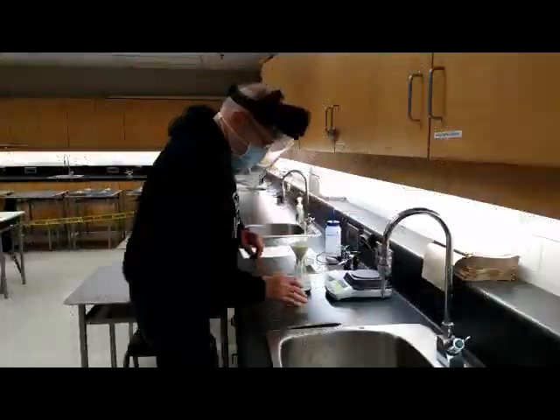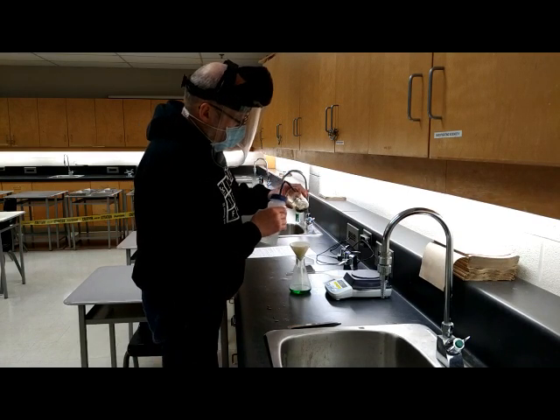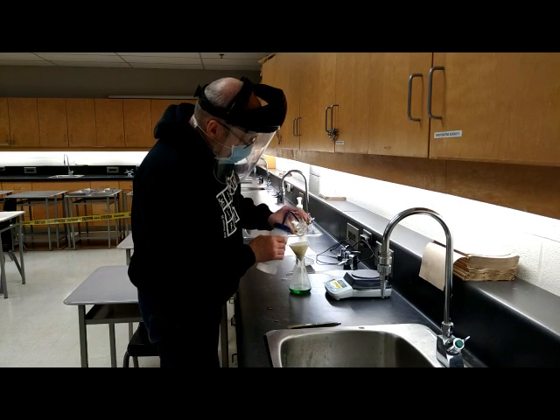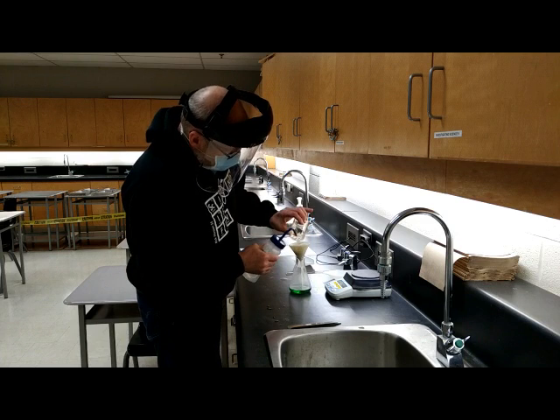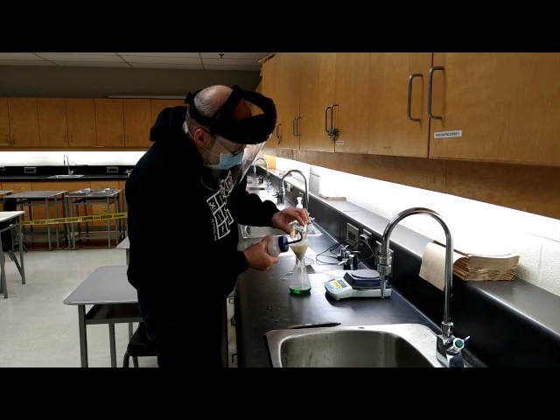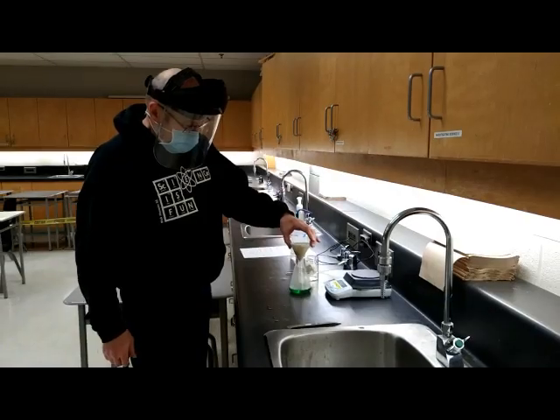So I've let some of the stuff run down, and so what I'm going to do now is wash out the remaining copper from my beaker. And so that's just going to get poured straight into there. Rinse out as much of the copper as possible. Last rinse. All the wee little bits there. Alright. And we'll just let that drain out.